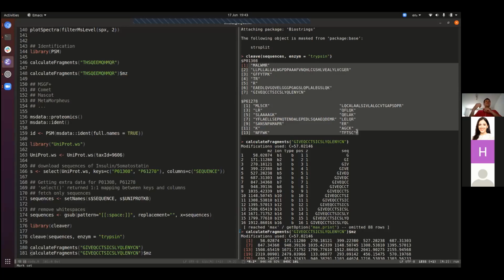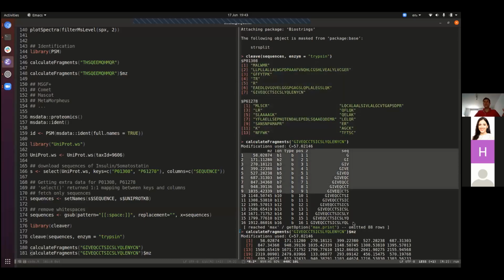We can assign a score depending on how many matches we have between the scans, the raw data, and the expected data. Let's say that score is simply the number of matches. It can be something more complex, but that doesn't matter.